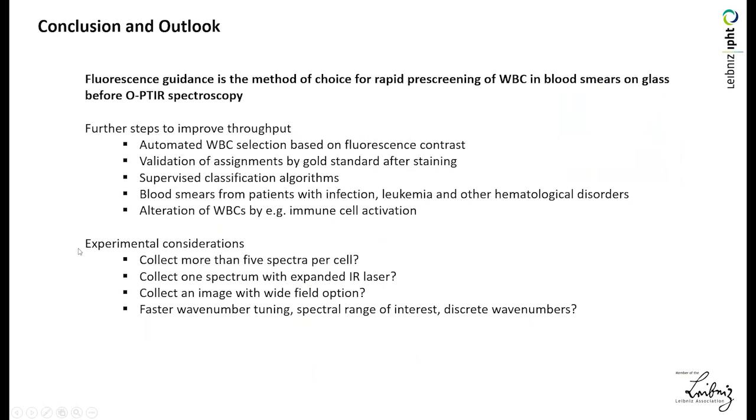Some experimental considerations. Yeah, we have to check if more than 5 spectra need to be collected per cell to better consider the variation in the cell. In the past, we used Raman spectroscopy for cell screening, and then we expanded the laser so that the laser focus collected the spectrum from each cell.